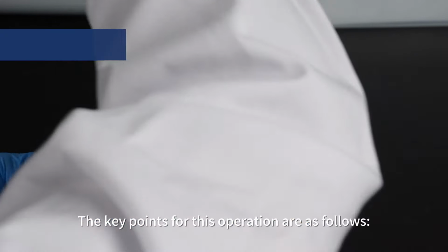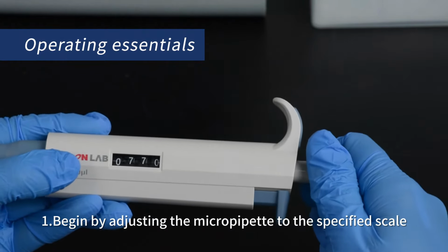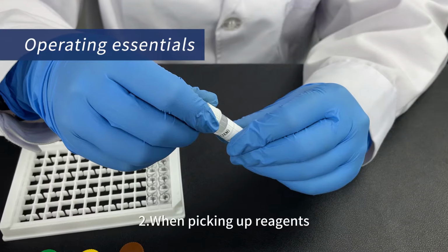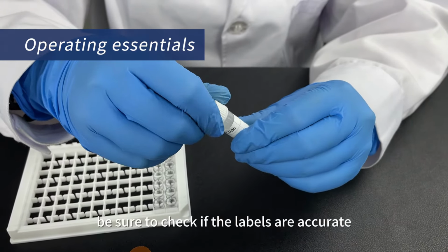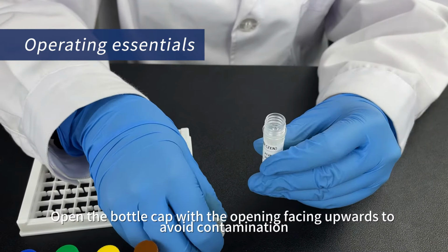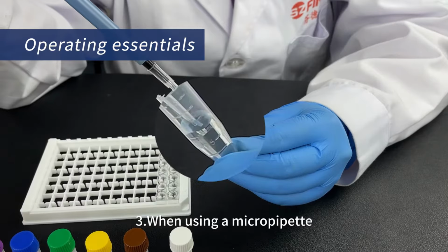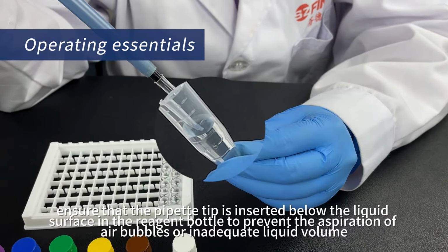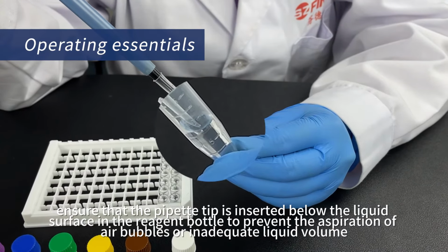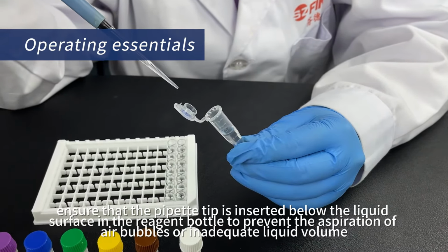The key points for this operation are as follows. 1. Begin by adjusting the micropipette to the specified scale. 2. When picking up reagents, be sure to check if the labels are accurate. Open the bottle cap with the opening facing upwards to avoid contamination. 3. When using a micropipette, ensure that the pipette tip is inserted below the liquid surface in the reagent bottle to prevent the aspiration of air bubbles or inadequate liquid volume.